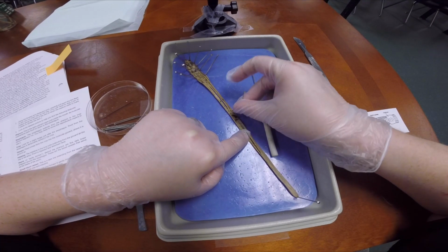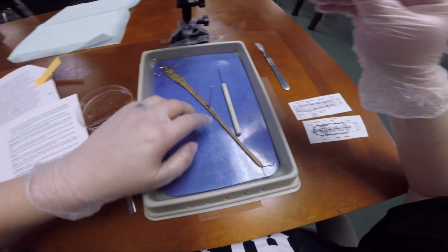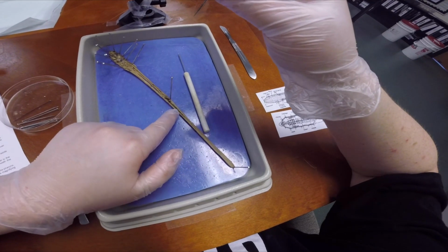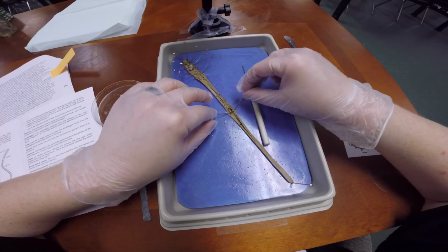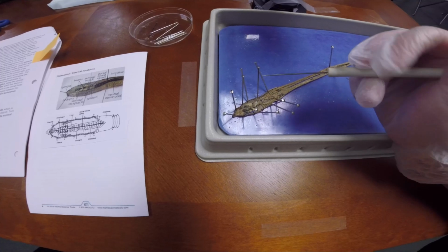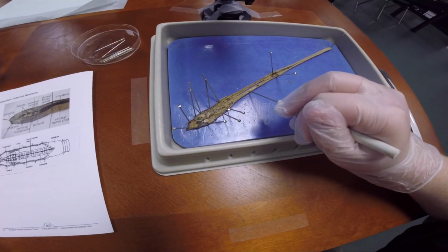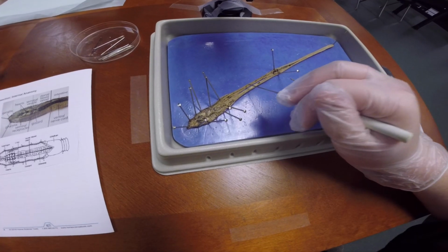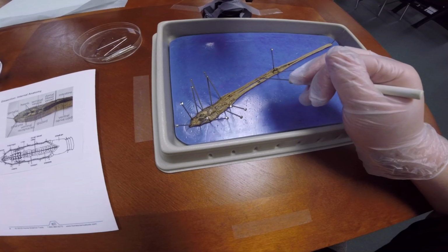So I'm going to pin him right here because you can actually see the blood vessel and the dirt he's been chewing on before he got here. Alright, so now that we have him pinned, we can see a little bit better. Now, I accidentally cut through our specimen, but I'm going to show you what's on the inside from where I can see.